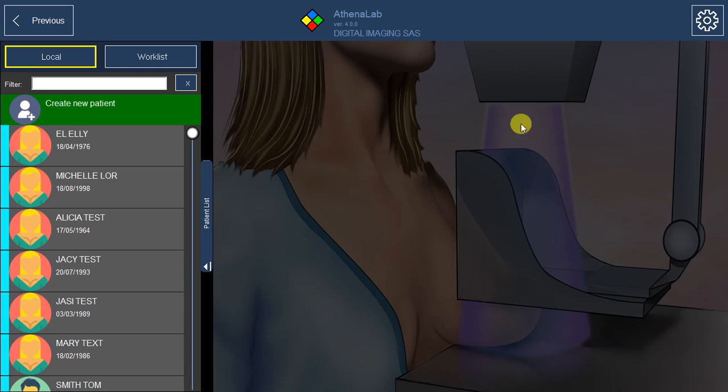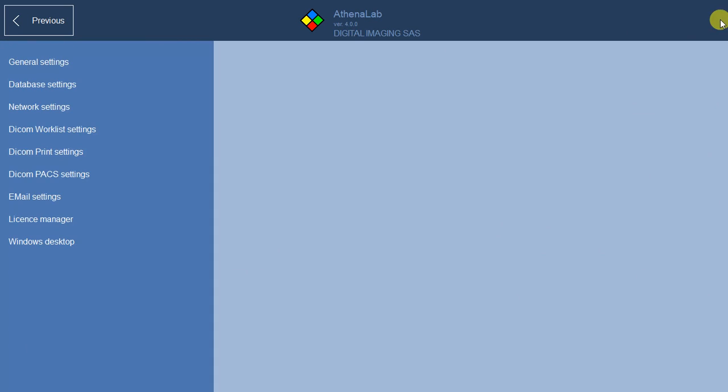This function allows you to shape the network. To access, click on the setup icon, then on network settings.